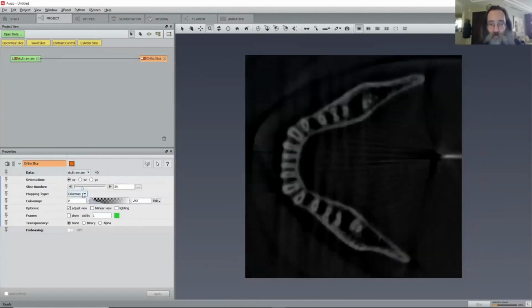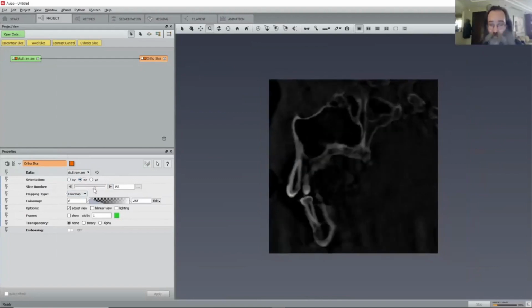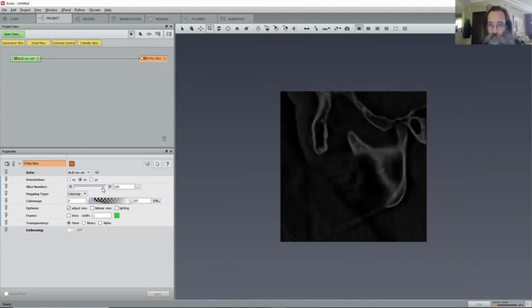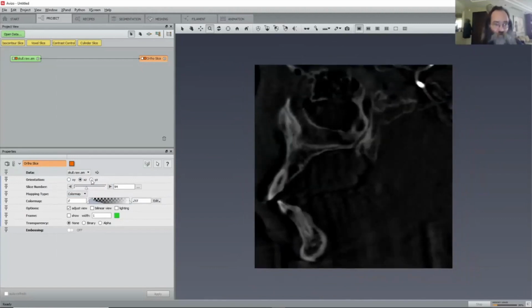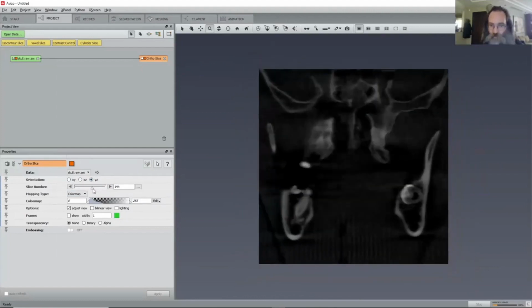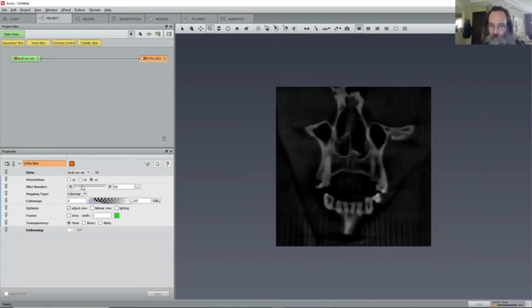The next thing is that we can choose a different orientation and slice through everything. Here you see the teeth appearing from this direction. Just slice through all of them. Here more teeth. In the third direction, from the back, obviously, the teeth are appearing now in front over here.